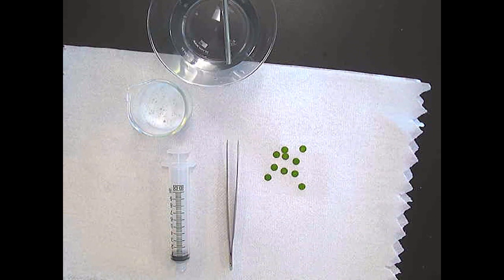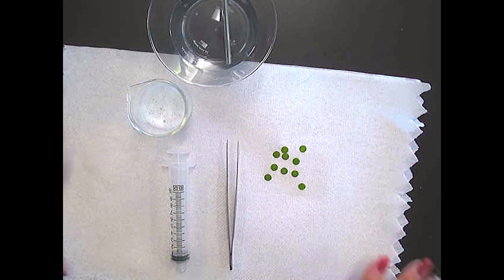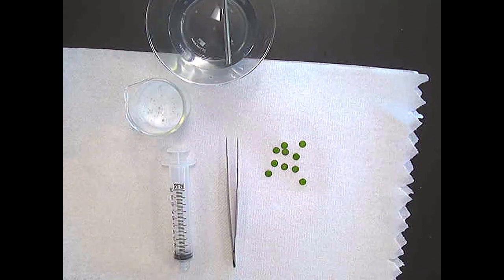Hi everyone, welcome to your pre-lab for your photosynthesis disc lab. I'm going to be going over the procedure with you guys as well as establishing the data you need for your control. Each group will be given a different question, and this is what you're going to be investigating in the lab. You'll also be given a rubric for the poster that you will turn in as the test grade.